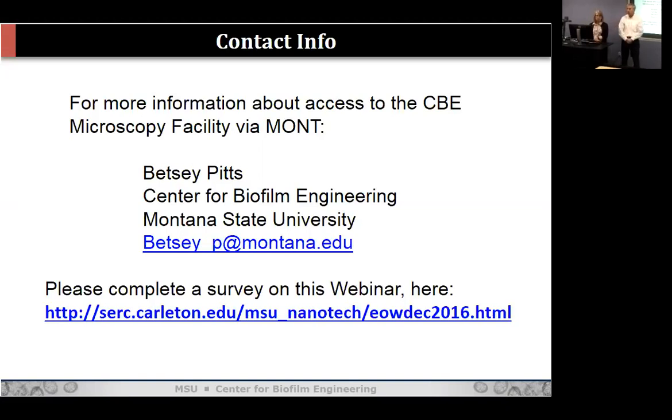Very compatible, having live cells in there as well. I was inspired by your sharklet surface and thinking if you wanted to see right at that surface, it might be easier to come up from below and see the colonization or the disassociation at the surface. And of course, it would depend on if you can see through that structured layer and how well index matched that was, and scattering and all that.